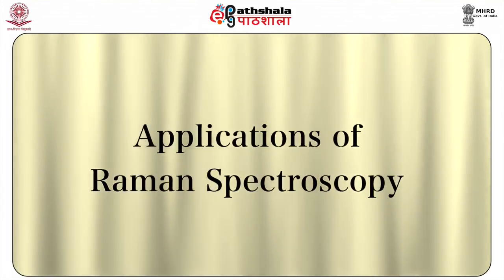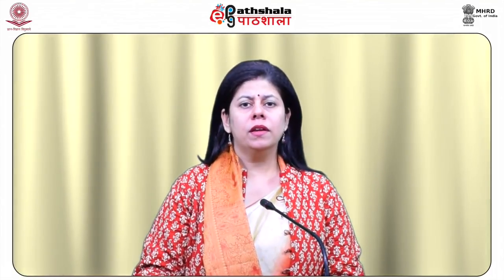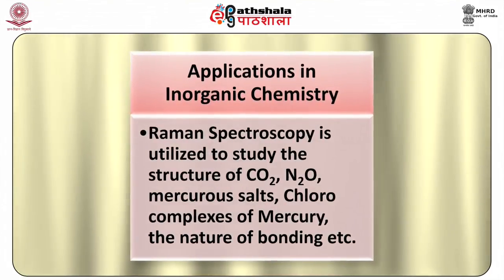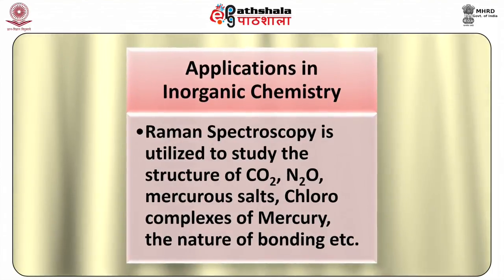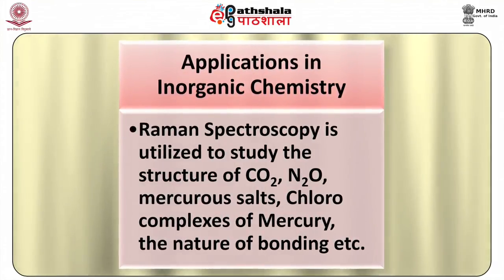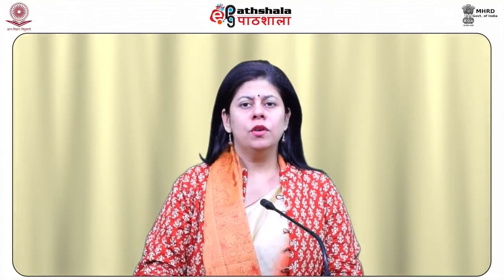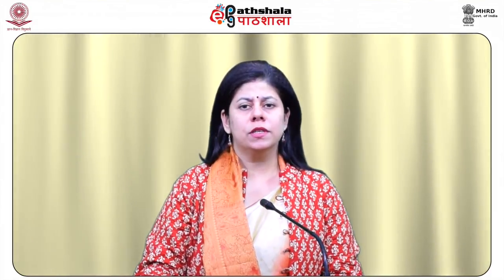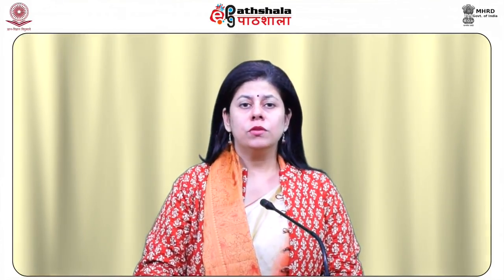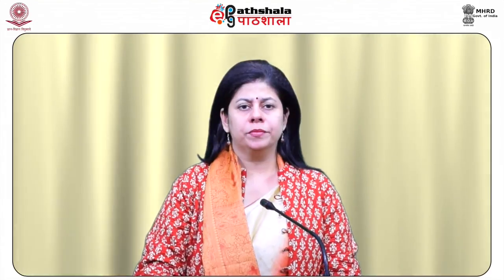Applications of Raman spectroscopy. Some of the applications of Raman spectroscopy in the physical, inorganic and organic chemistry are as follows. Applications in inorganic chemistry. Raman spectroscopy is utilized to study the structure of CO2, N2O, mercurous salt, chloro complexes of mercury, the nature of bonding, etc. Application in physical chemistry. Raman spectroscopy helps to study physical chemistry concerning electrolytic dissociation, hydrolysis and transition from crystalline to amorphous state. It has also been used to study the single crystal and is much recommended over infrared technique.